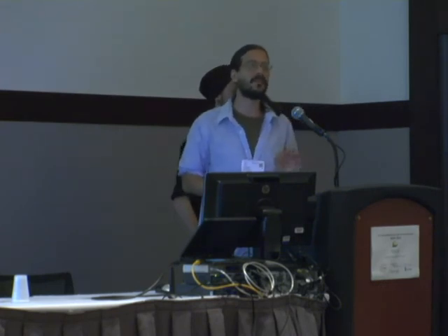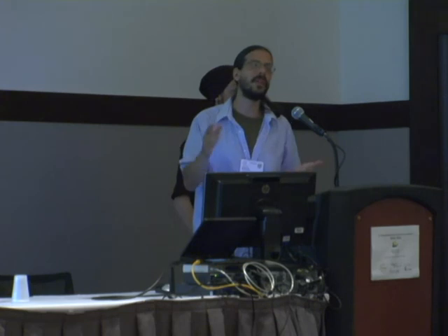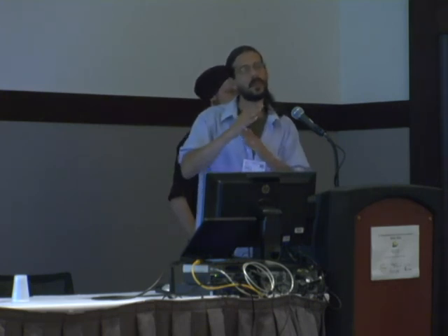But no plans for after it starts moving? We've created some preliminary plans. The imaging is fast enough to freeze frame it even when it's moving, but that doesn't mean the image quality is quite good enough to see where everything is. Motion blur is not what you're so much worrying about. You're worrying more about just how small and how fiddly the morphology is and how easy it is to lose one cell up against another, even to your eye.